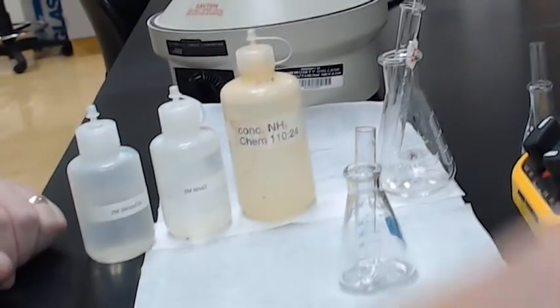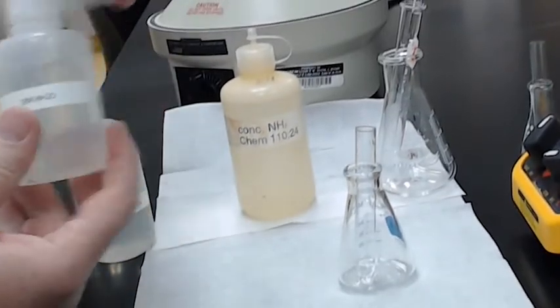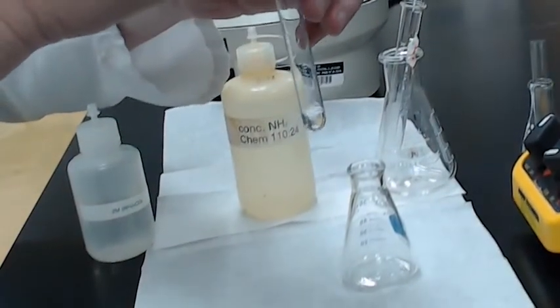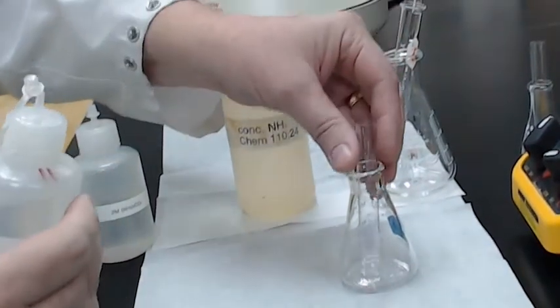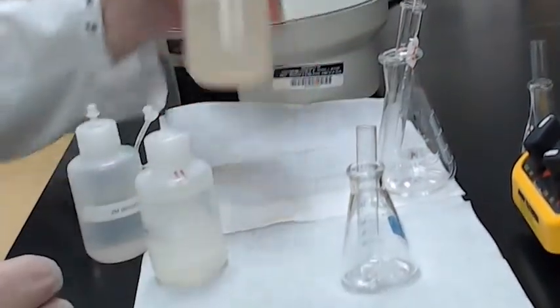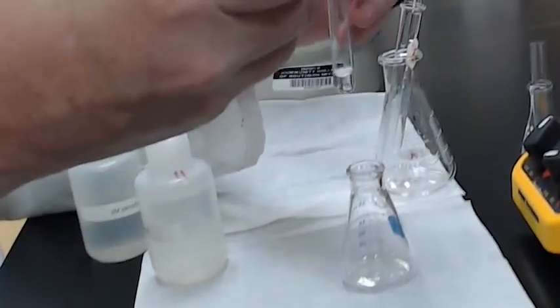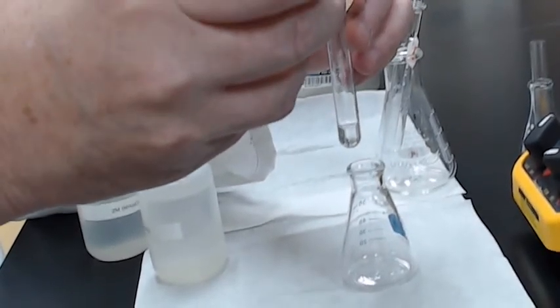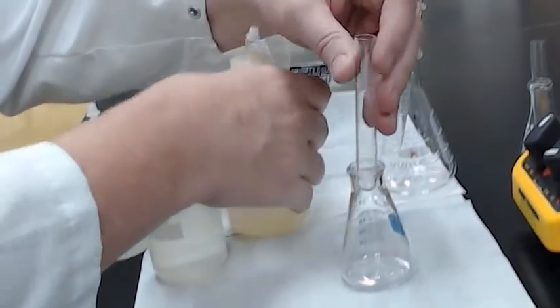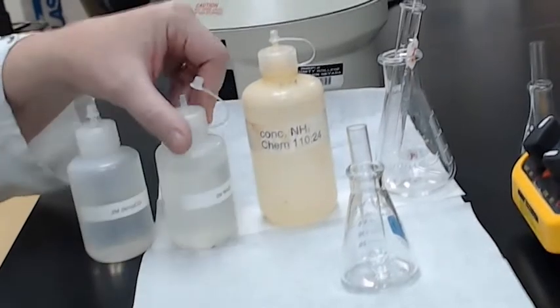Okay. We are now, the important part, we're going to create a buffer with ammonium chloride. It's a lovely buffering agent. And we're going to start with 4 drops of ammonium chloride. 1, 2, 3, 4. Okay. And then we're going to make it alkaline by using concentrated ammonia, also written as 15 molar ammonia, or ammonium hydroxide. It usually only takes 1 or 2 drops. It is now quite alkaline. And then we're going to start precipitating.